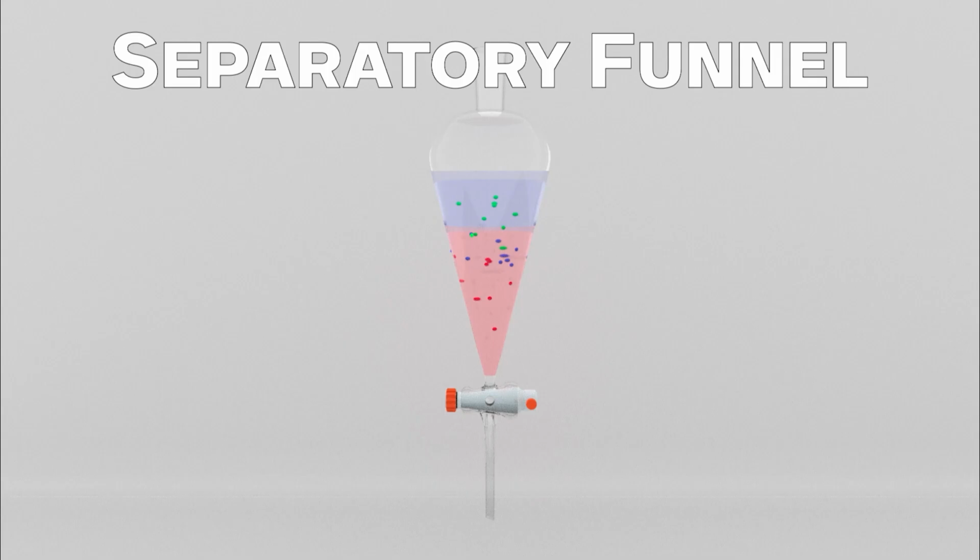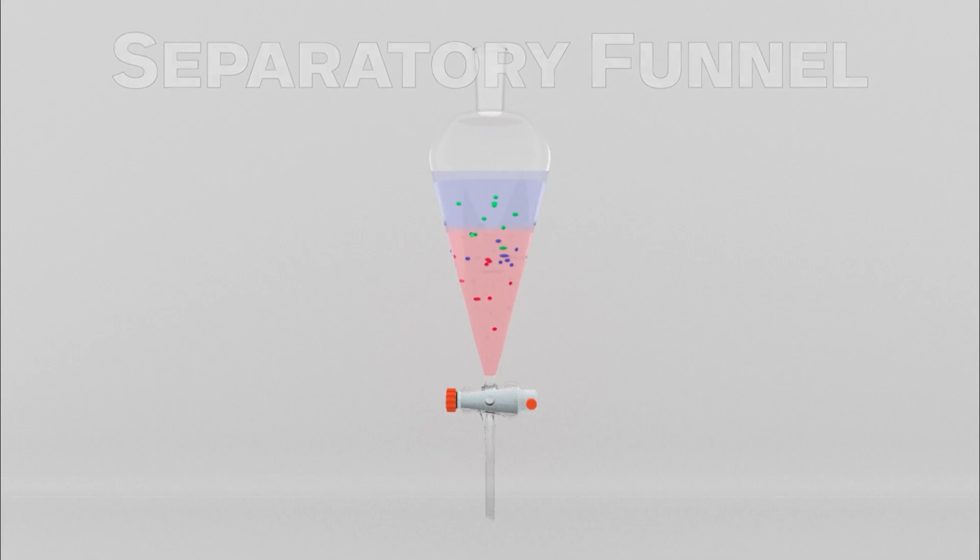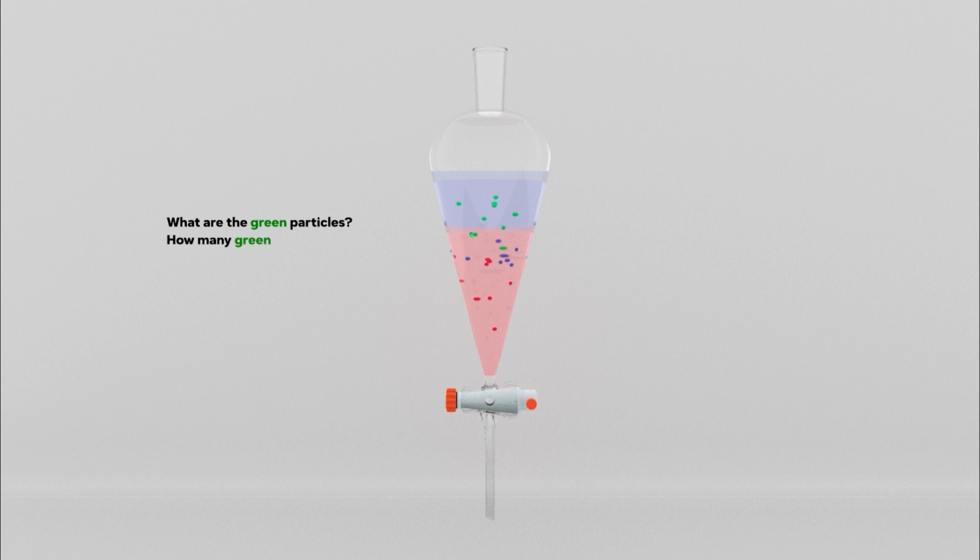The basics. When we are tasked with the identification and quantitation of a chemical or series of chemicals, one of the first questions we ask ourselves is, How can I differentiate or separate the compounds I want to identify from all the other chemicals in the sample matrix? So first, we begin to look for physical or chemical differences that allow us to separate the compounds. One such difference is polarity.